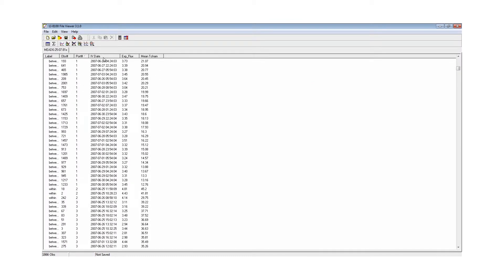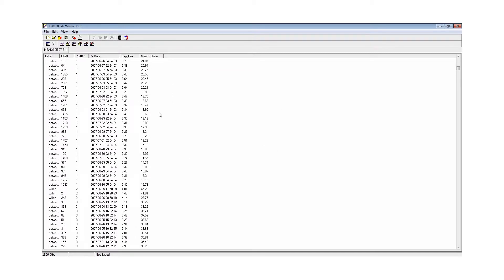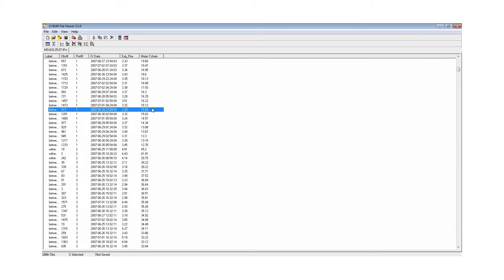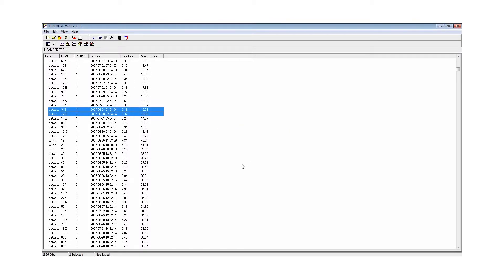It utilizes an easy-to-read table so you can sort through key variables. This gives you the option to include or delete outlier data that may or may not be useful in your final analysis.